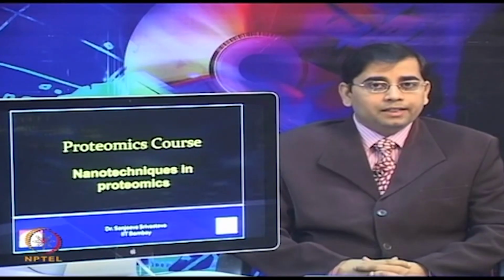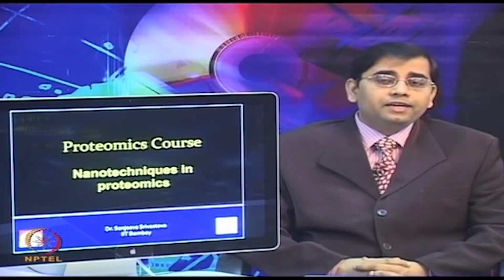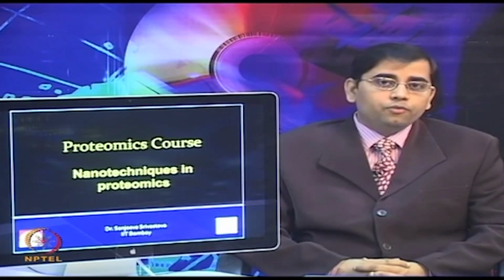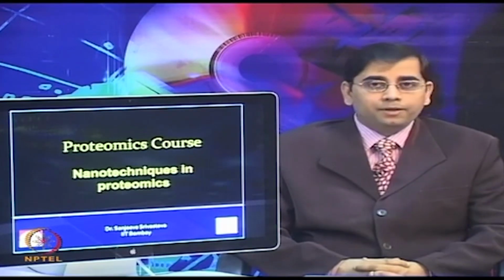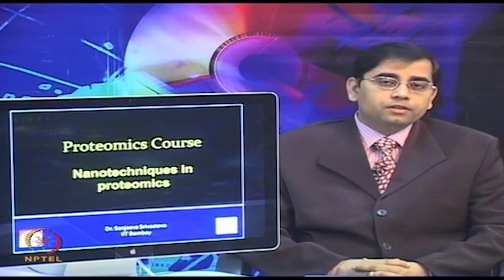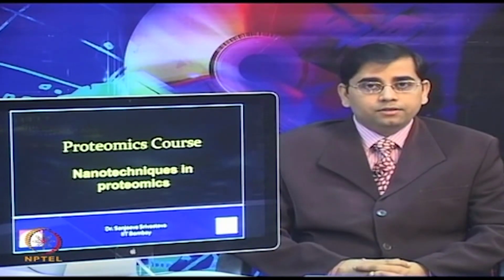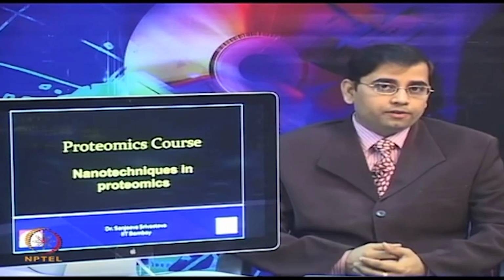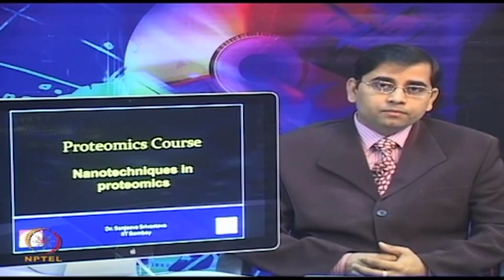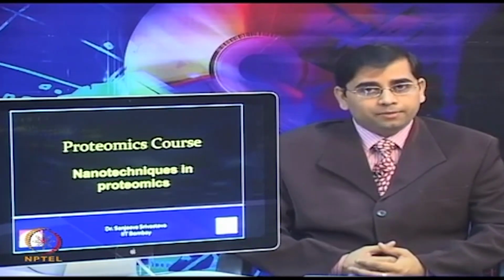In the same theme and same continuation, today we will talk about different types of nanotechniques, how they can be used for various types of proteomic applications. We will discuss more on their principle, some of the advantages and disadvantages which each of these methods offer. And very briefly, we will touch upon how these nanotechniques are applied for proteomics based applications.